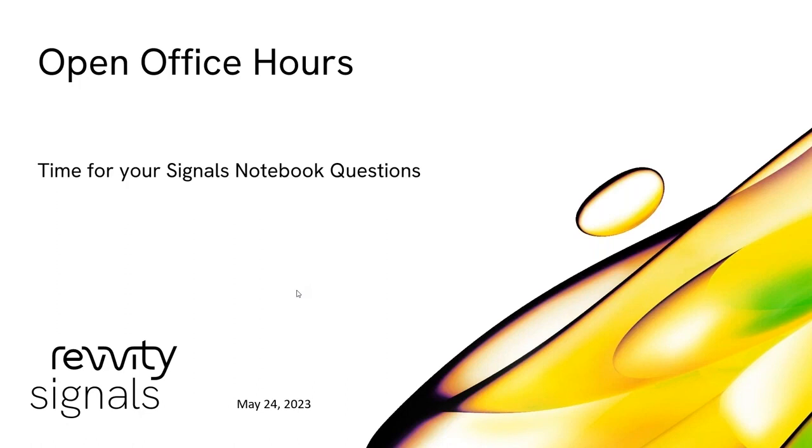Okay. When do you expect that the power users will be able to create worksheets and group templates without involving an administrator? I mean, they can right now. So power users can create worksheet templates. They can create everything they need within worksheet templates. The one exception is right now if they need to create properties using our attribute lists. So that is something we're looking at right now, but that's the one exception. They can do everything else that they need today.